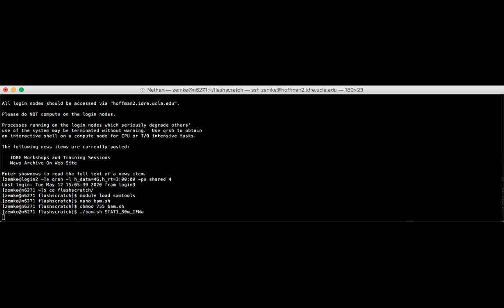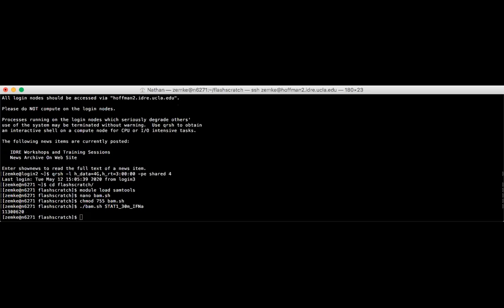I had a good question. So the -c parameter means count. So we're using samtools view with -c to count the lines in the BAM file. The -b means output as a BAM file. So we're converting the SAM to a BAM with that parameter.